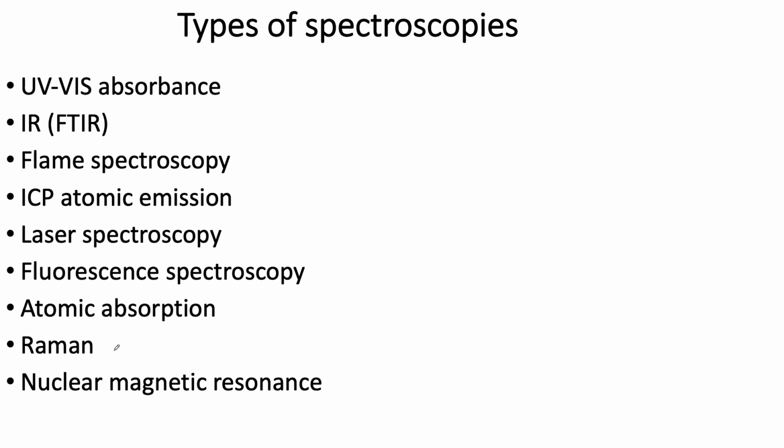And so then what happens is that light interacts with matter, and it shifts the energy just by an amount equal to the vibrational bands. So you can use this Raman to look at vibrational bands. And it's somewhat like infrared, but it's different. You're putting in a strong light, and you're looking for a wavelength coming out at a different wavelength. It's just shifted. And then we have nuclear magnetic resonance, which is, again, this is the nuclei, usually hydrogen nuclei. We're looking for, and we'll talk about this more later, it's in the radio frequency range.